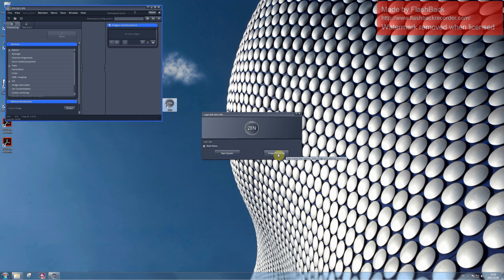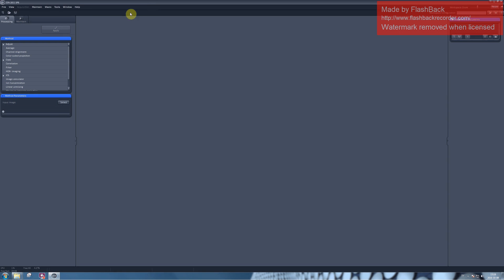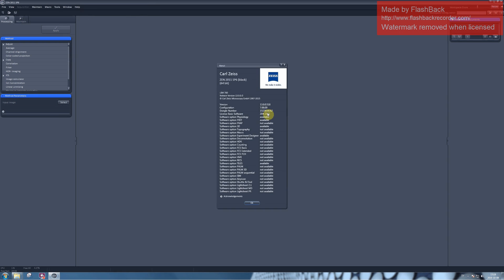When you open the Zen software and you want only to edit images, please select Image Processing button. Under the Help menu and in the About option you will see that now you have access to licensed modules as 3D reconstruction and so on.